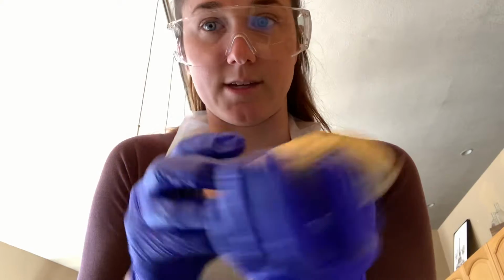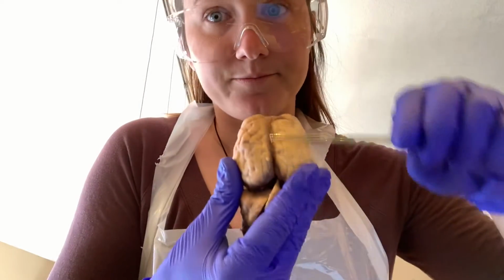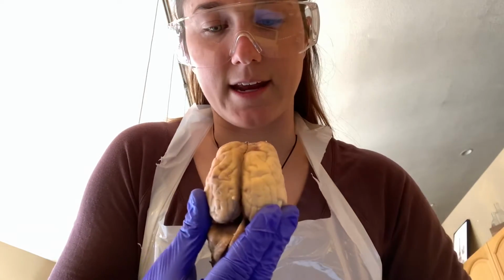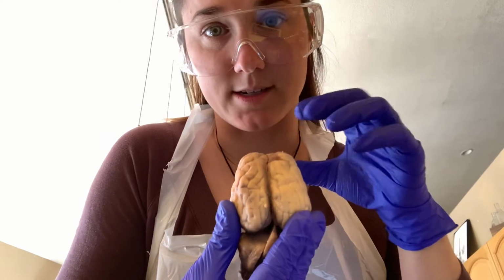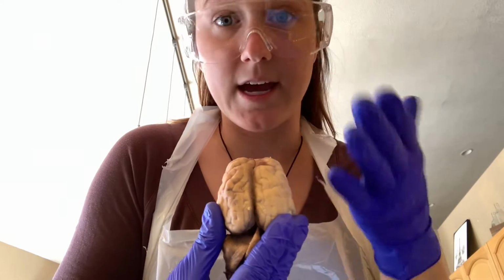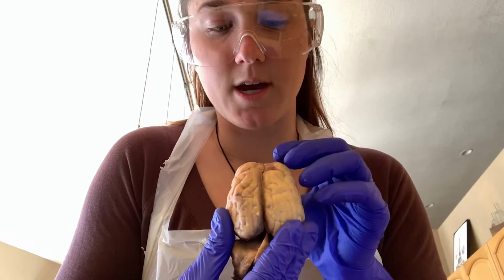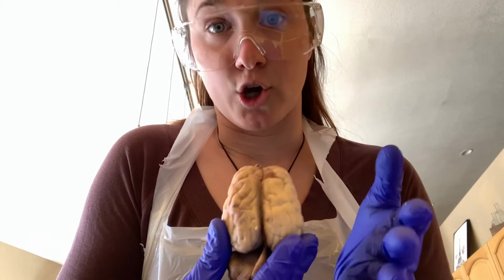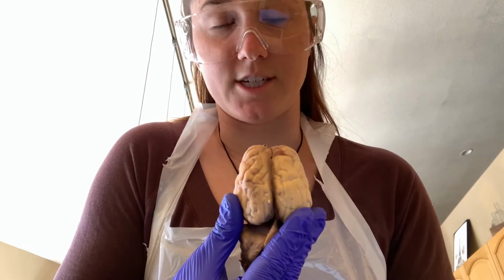Next we have the cerebral cortex, and this is what you see here. This is the superficial part of the brain, and the cerebral cortex involves all of the higher functioning processes that our brain does, including thinking, forming memories, and mathematical computations. The cerebral cortex is divided into different lobes, and each lobe corresponds to the skull above each section.